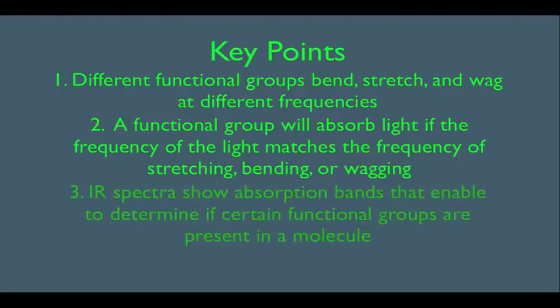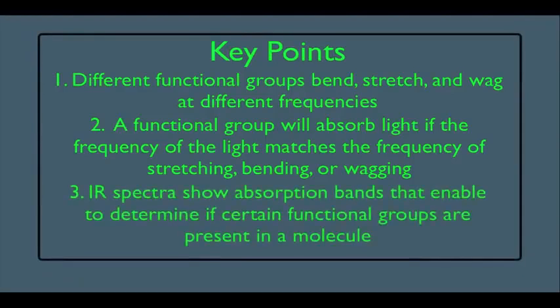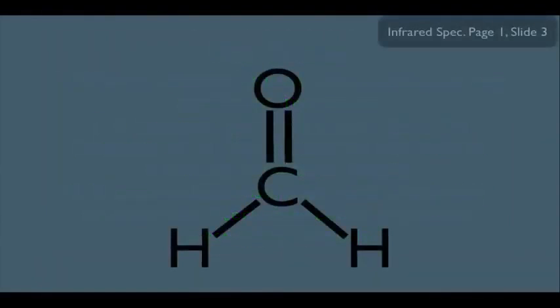And lastly, what we're going to see here is that IR spectra show absorption bands that enable us to determine if a certain functional group or groups are present in a molecule. So let's see how this works. What you see here is the molecule formaldehyde.